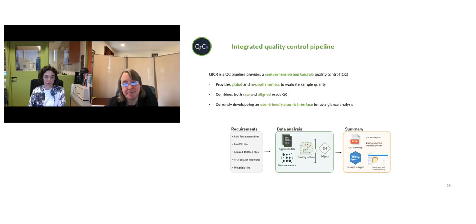Based on this, we created an integrative pipeline that is currently focusing on TCR, because we did not integrate anything about the clones, which is really important for the BCR, and that would need to be added to this pipeline. So you can use it for BCR, of course, but it will lack some features.